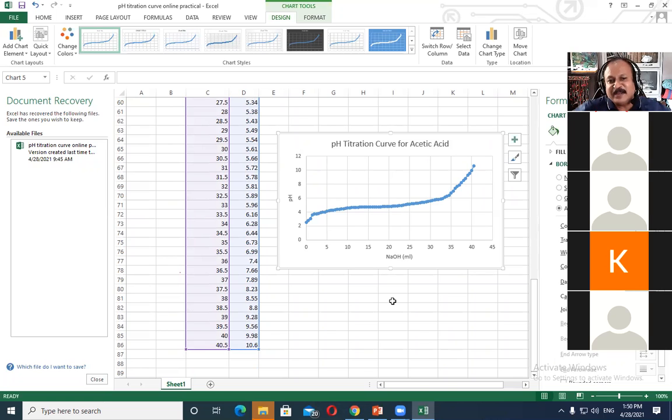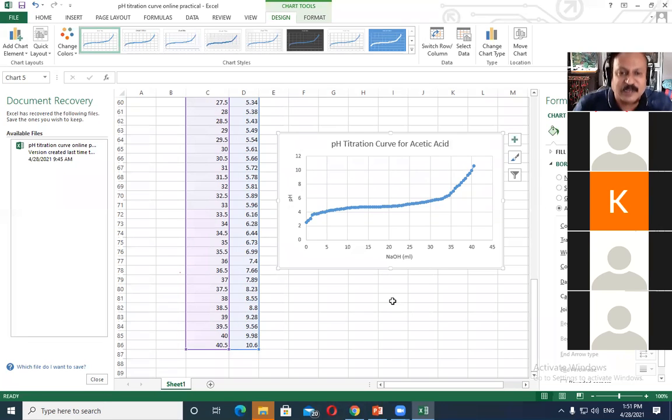हाँ, तो इतना असाइनमेंट करेंगे सब जन, राइट? और कल के सेशन में बता दो, कल भी एक हम डिस्कशन करेंगे दूसरे प्रैक्टिकल का. तो उस समय मुझे ये बोलो, कुछ डिफिकल्टी होगी तो बोलो, नहीं तो सबमिट कर दिया तो भी चलेगा. You can submit the Excel sheet also, no problem. एक्सेल का जो भी डेटा तुम्हारा है ना, वो फाइल मेरे को तुम सेंड कर सकते हो. ओके, either on WhatsApp or by email, कैसे जैसे भेजना है वैसे भेजो, कोई प्रॉब्लम नहीं, तो फोटो निकाल के भेजा तो भी चलेगा. ओके, if you are putting it on a blank paper or a graph paper, okay, then you can take a photo shot and you can send it to me. Is it okay?